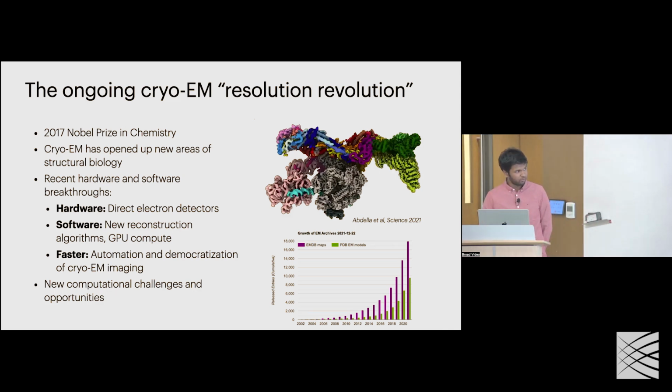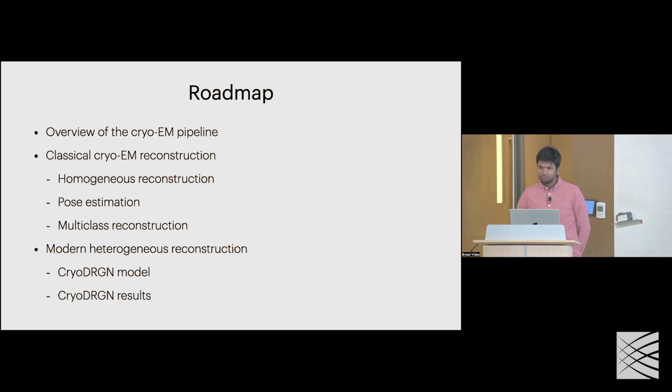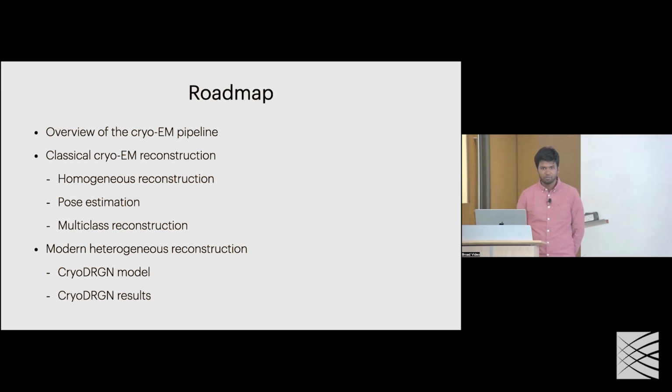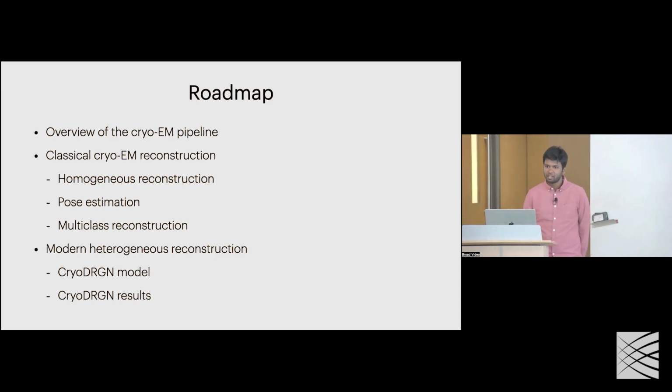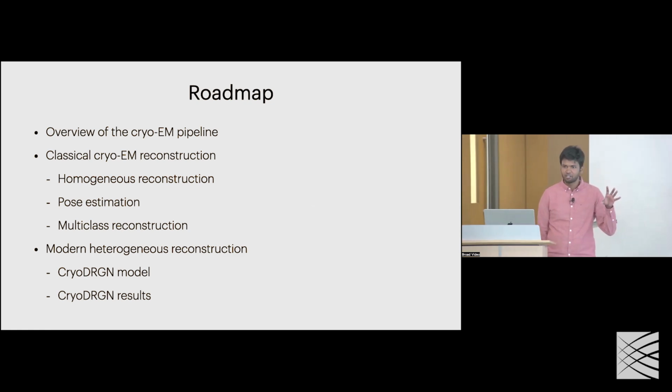This also comes with a whole new host of computational challenges and opportunities. And so the plan for today, I'll start off with an overview of the whole cryo-EM pipeline, going from, if you're a structural biologist interested in studying some protein, how do you go from an idea of that target protein to actually depositing a structure in a database like the Protein Data Bank?